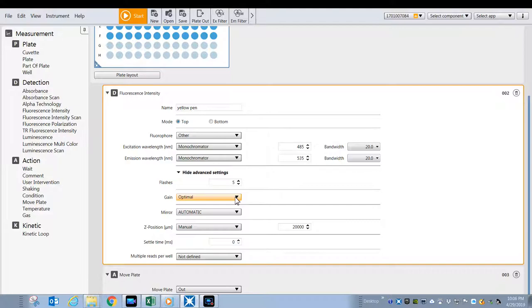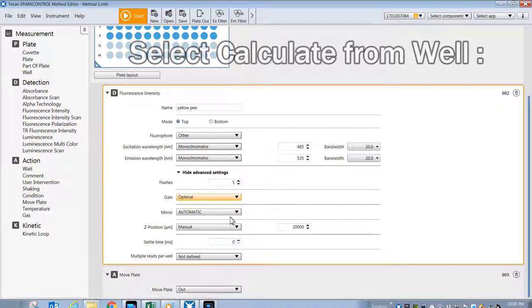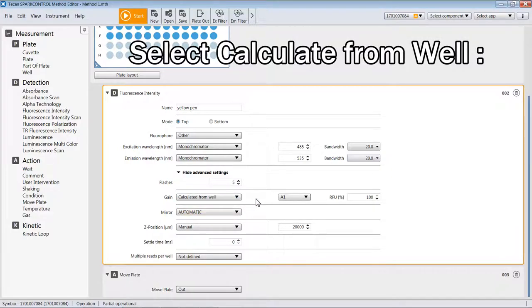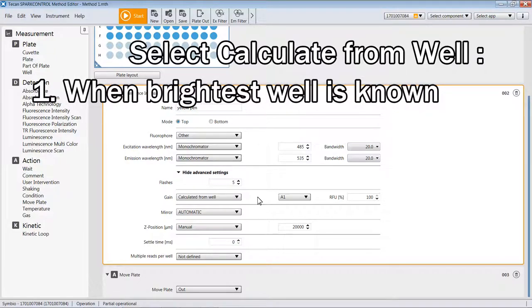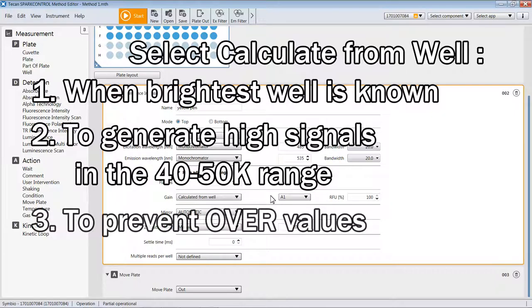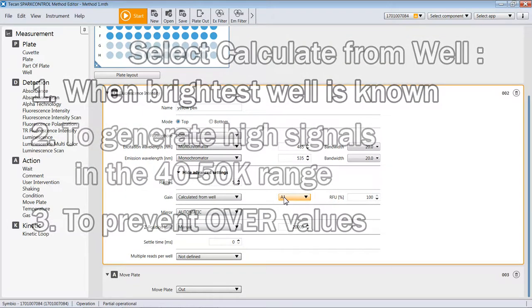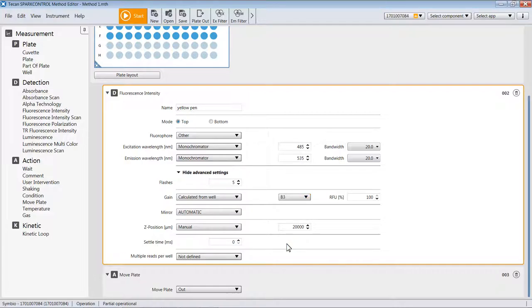There is an additional option for determining gain called calculate from well. You would use this feature if you happen to know where the brightest well is on the plate. This saves the reader time of not having to go around and find the bright well on its own, so this is a little bit faster way of measuring. It would go to the well you designate and adjust the voltage so that that sample would have counts between 45,000 to about 50,000. There is a pull-down menu where you can select the wells that you want it to go to do this calculation from.